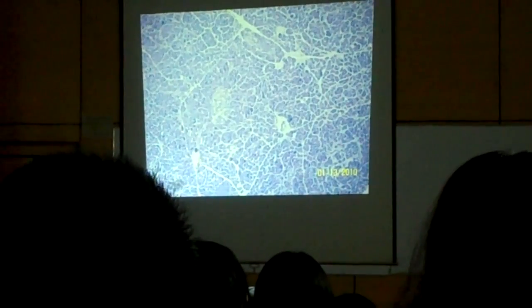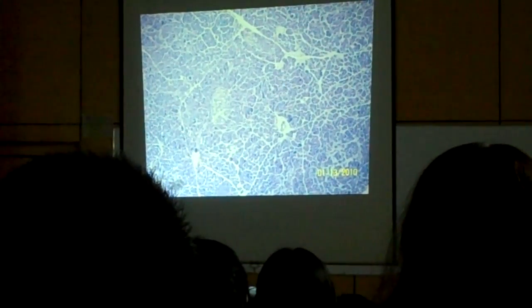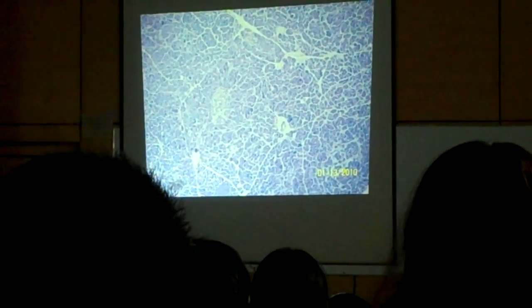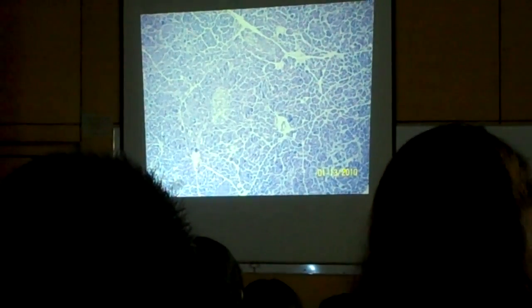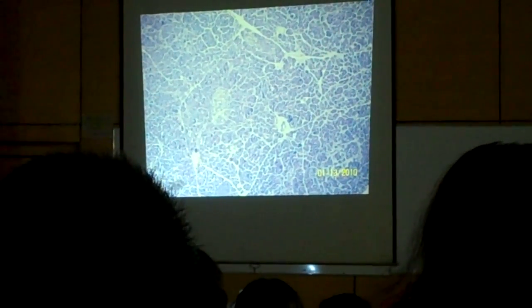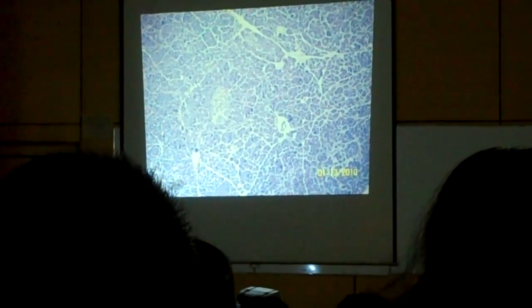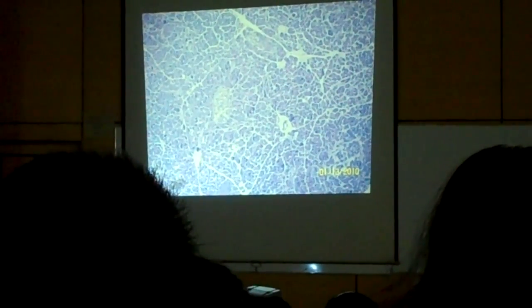The slides are of no particular order, and at the scanner view, I hope you can readily recognize the organs. So you only have to think of endo and repro organs. But since endo organs are in different locations, you must also know where they are. So identify the organ.